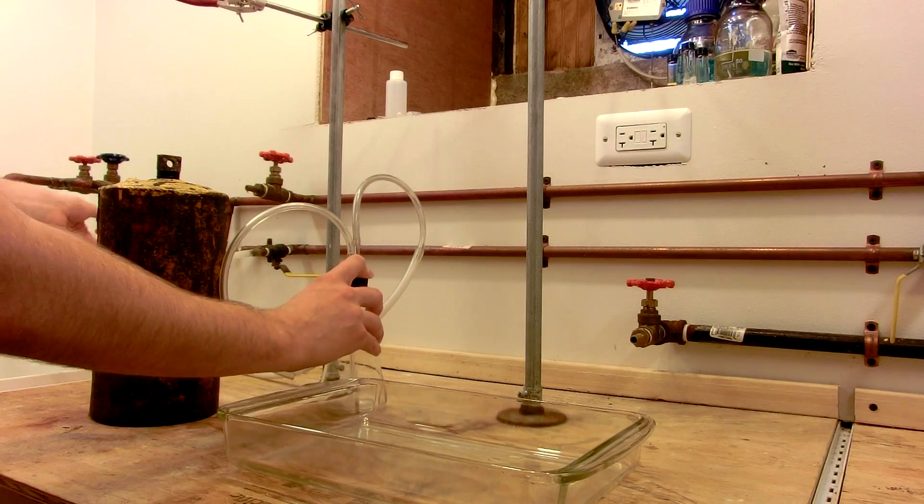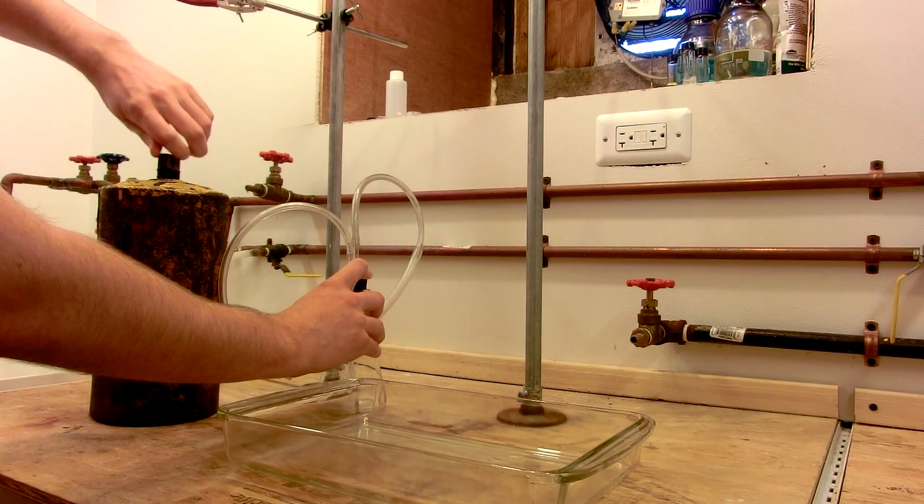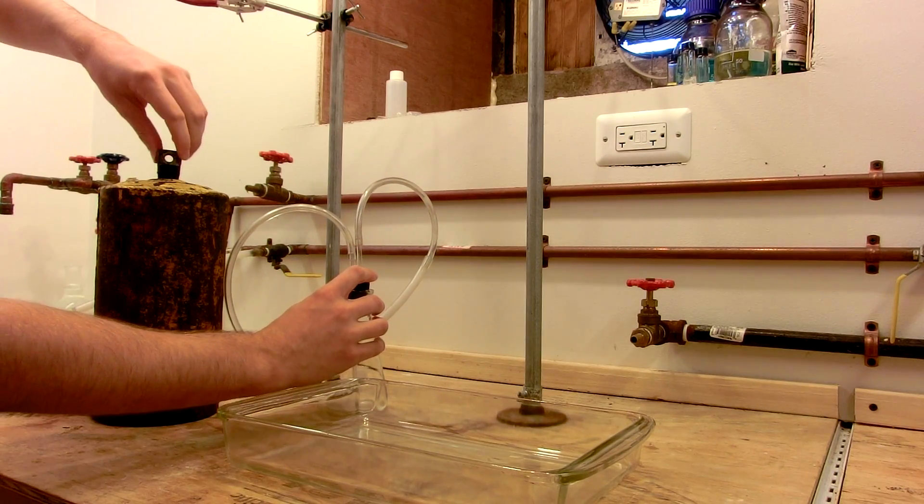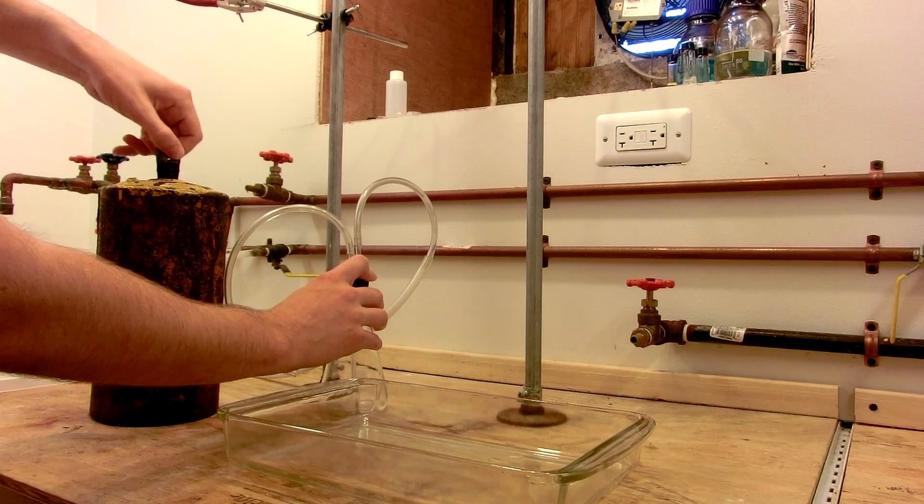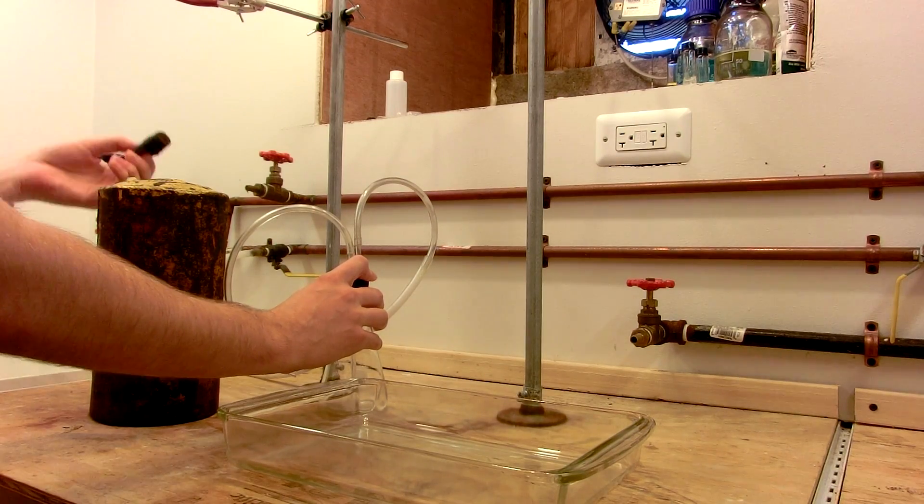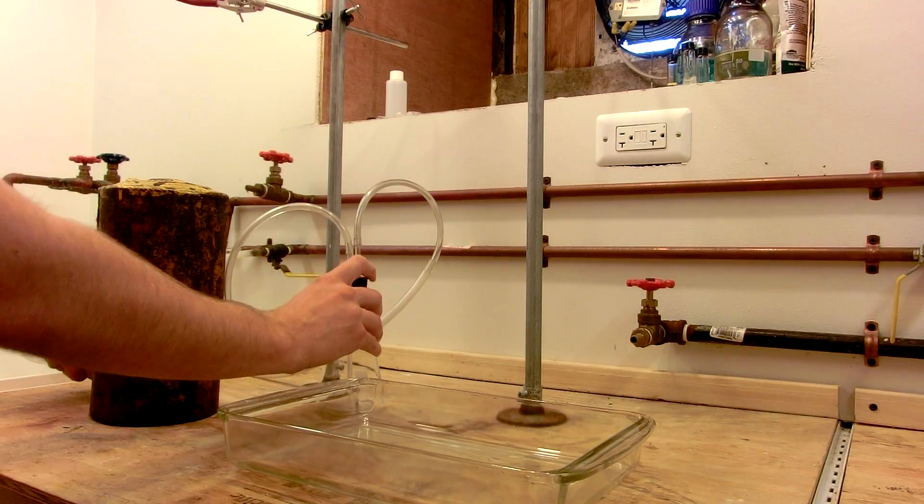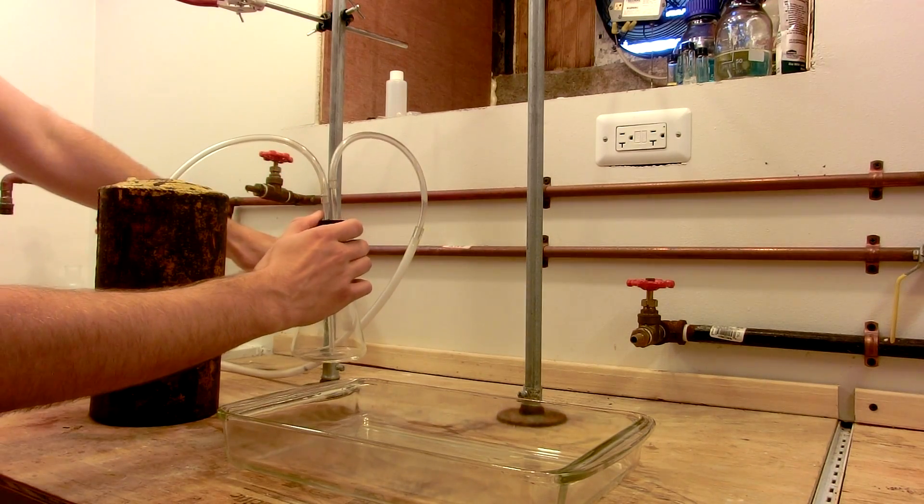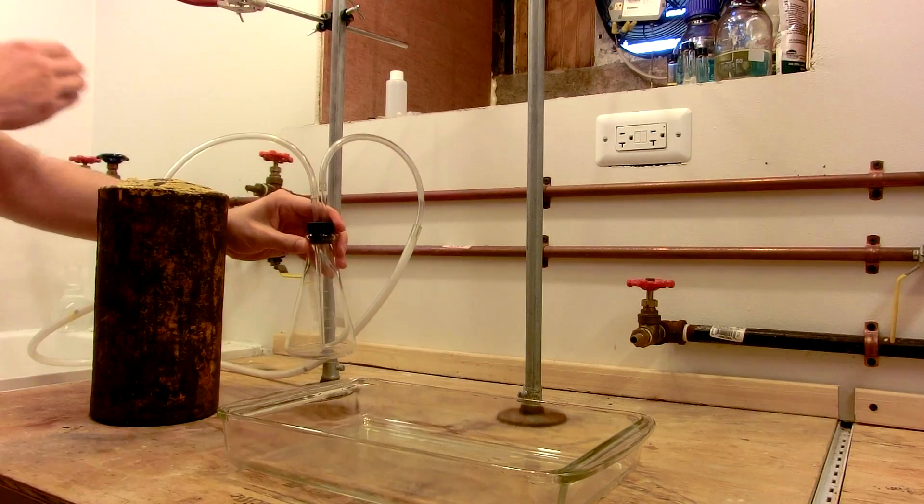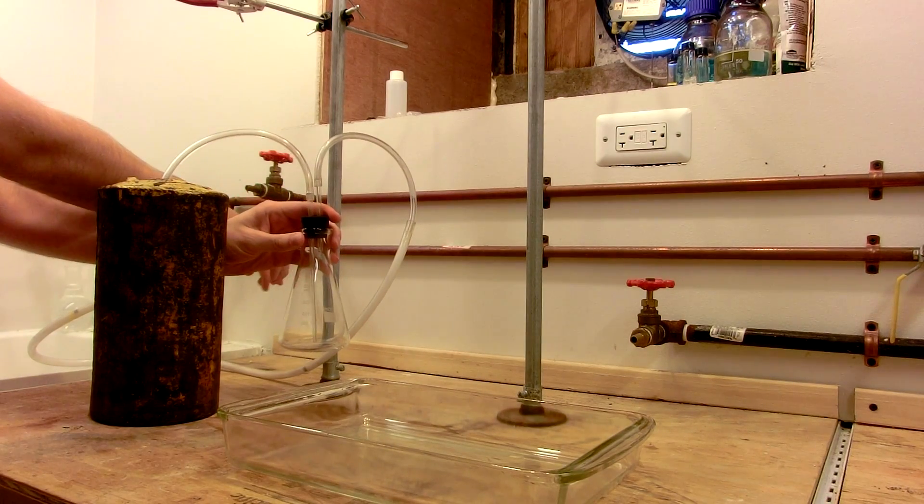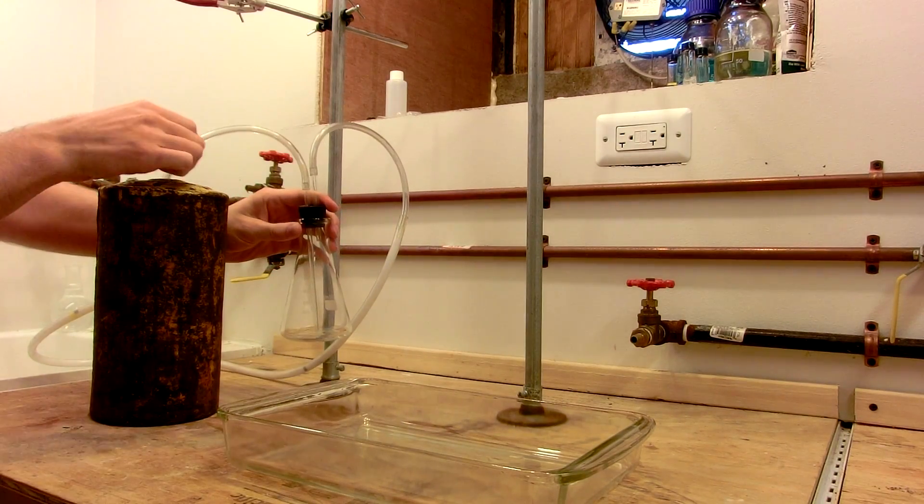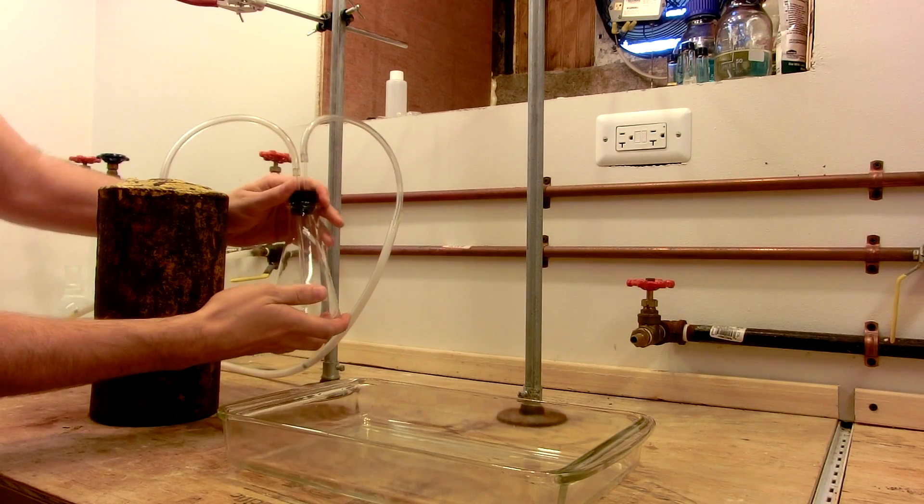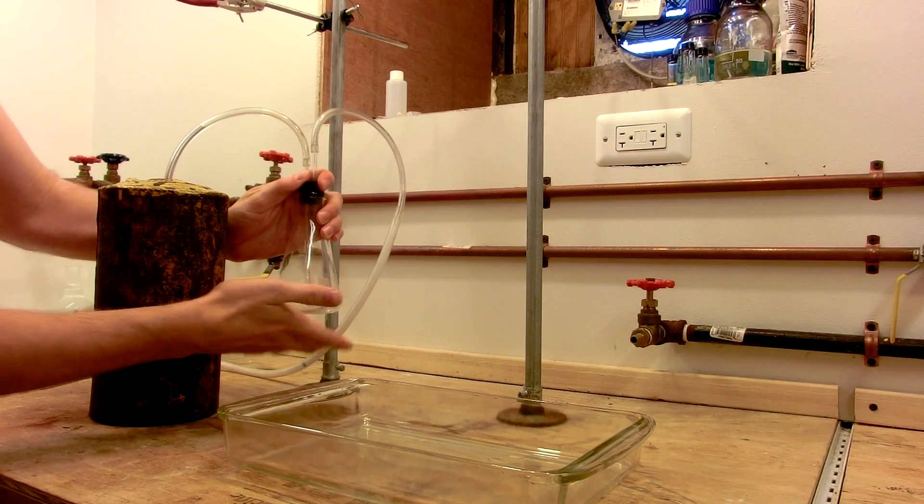The aspirator is on. Open the flask. Always do this in a ventilated room because mercury vapors are no joke. It's a cumulative poison. It's a neurotoxin. You've got to be careful. Now I'll open up the vacuum. With flask, I can get it sealed. Here it comes.